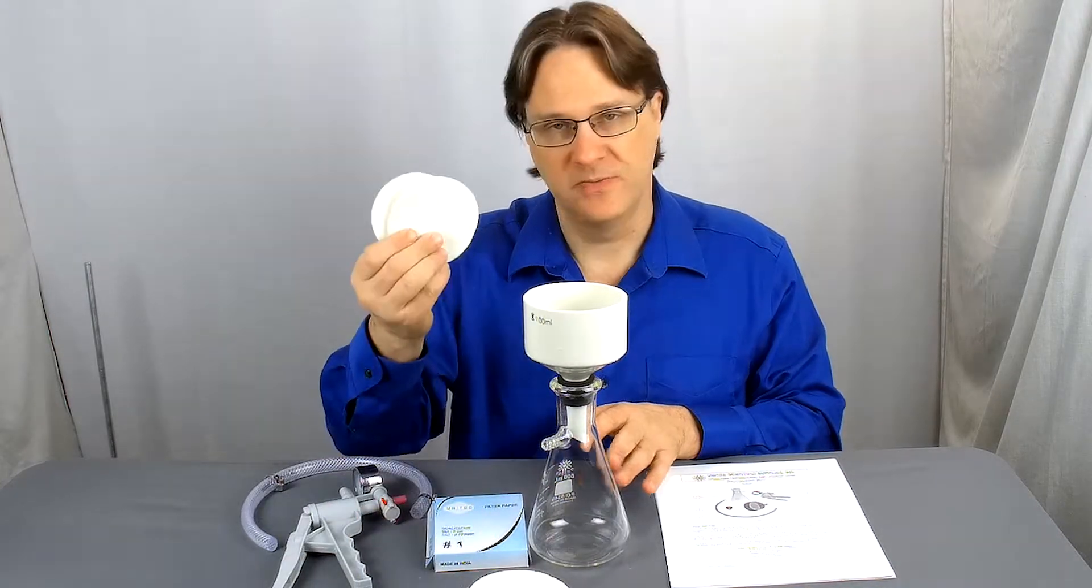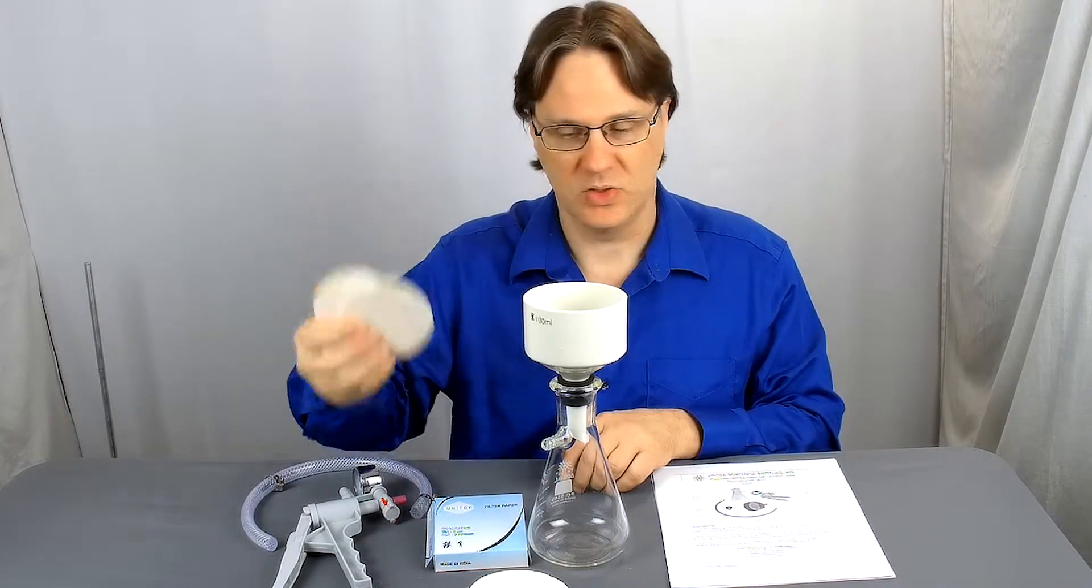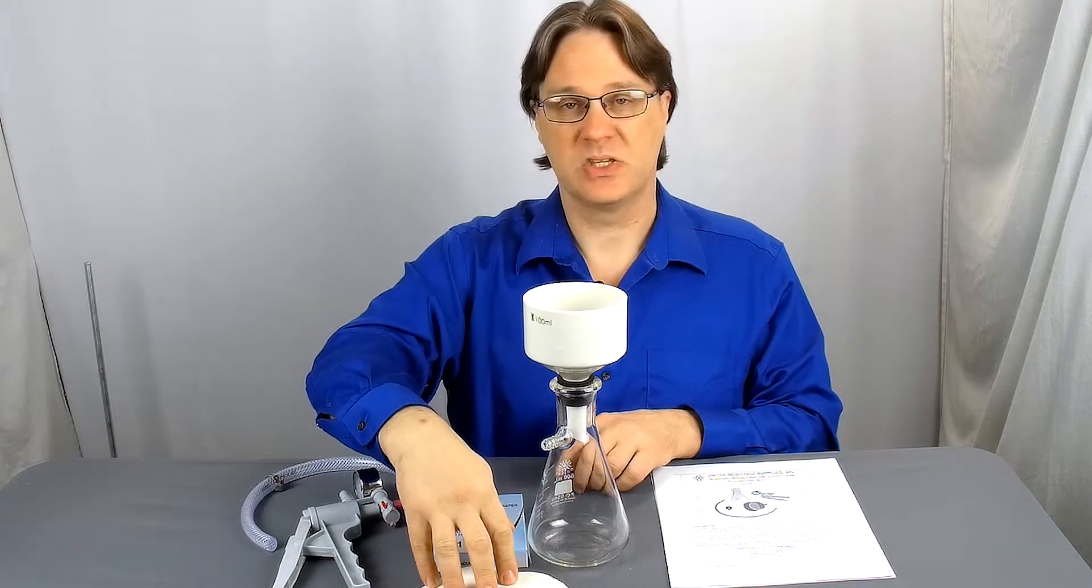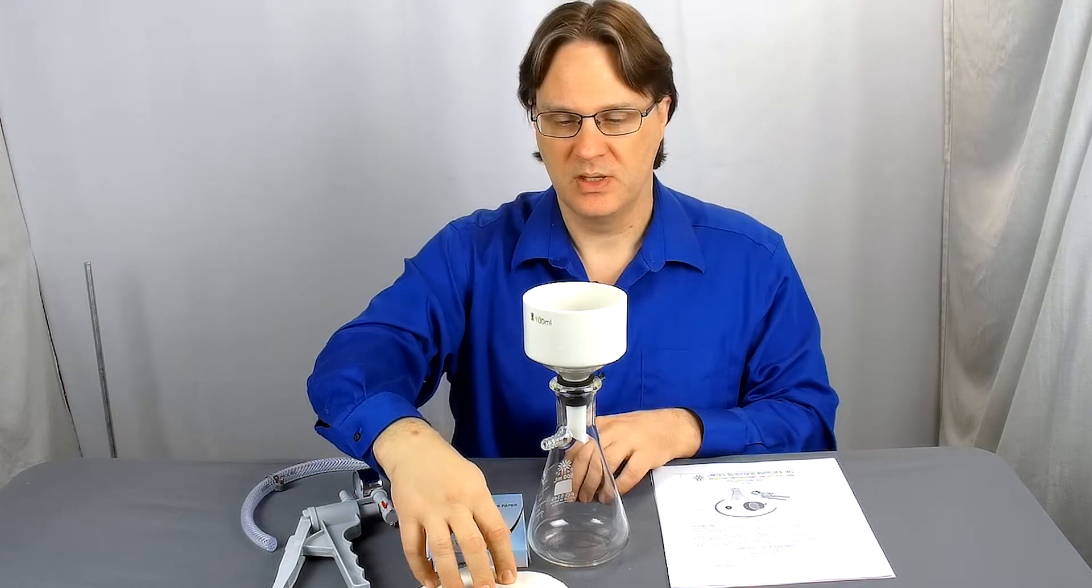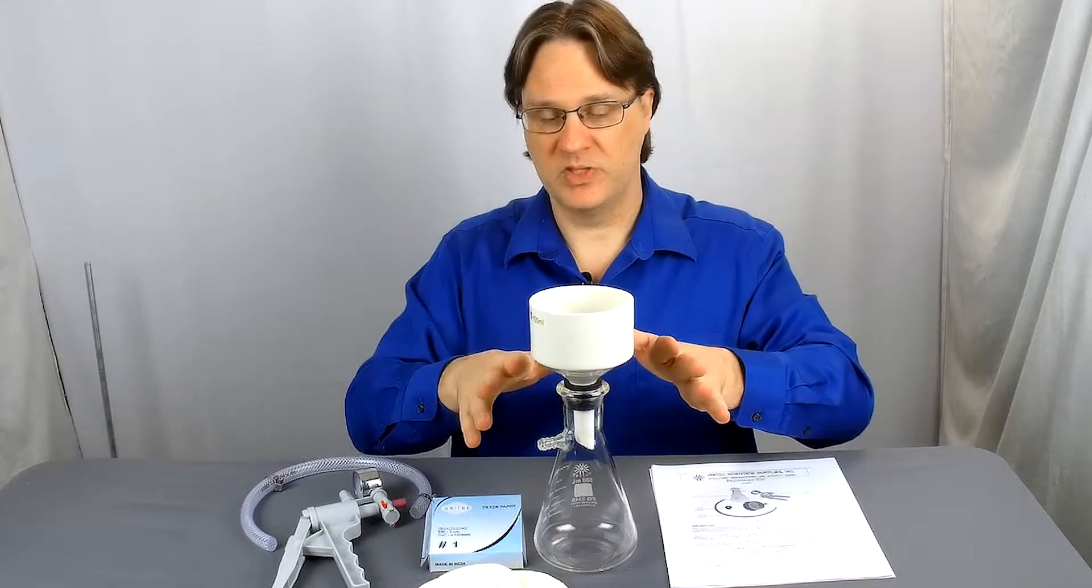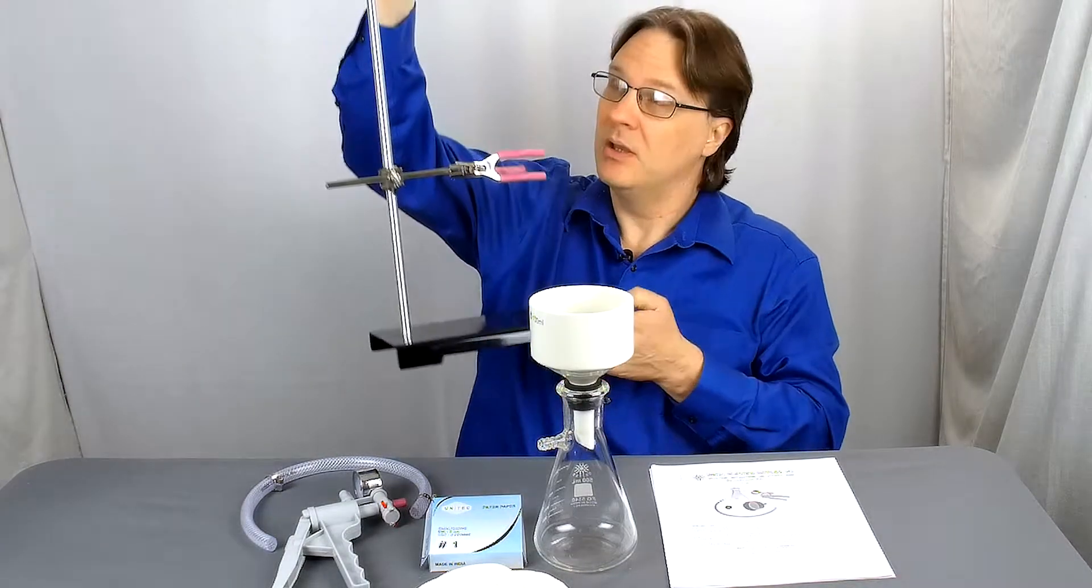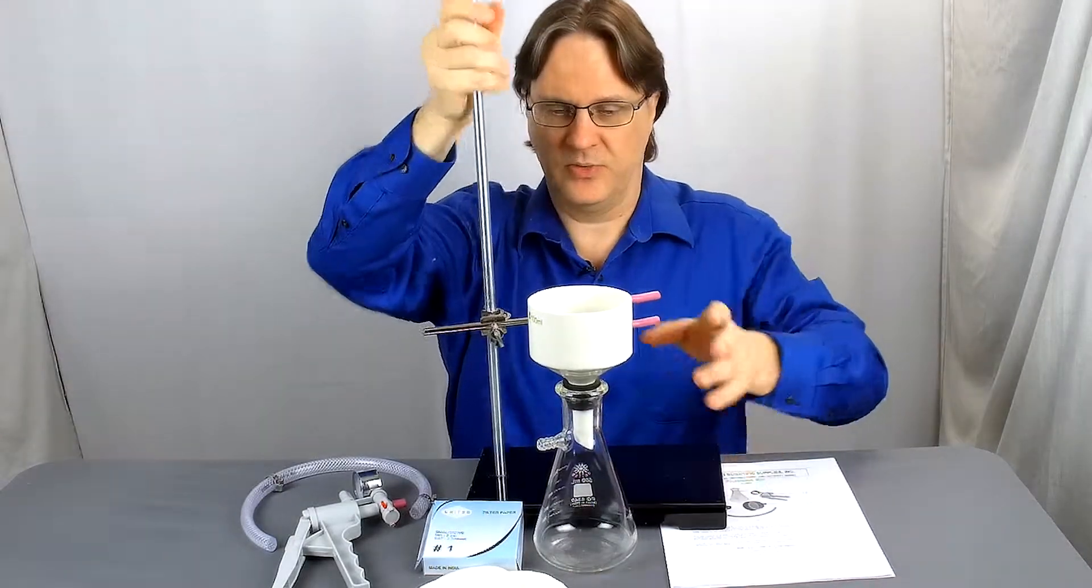It comes complete and has a box of filter paper, so if you ever run out you can always get more. But you have at least a hundred pieces to start a hundred experiments with. As I showed you before in the video, this is fine to use on its own.